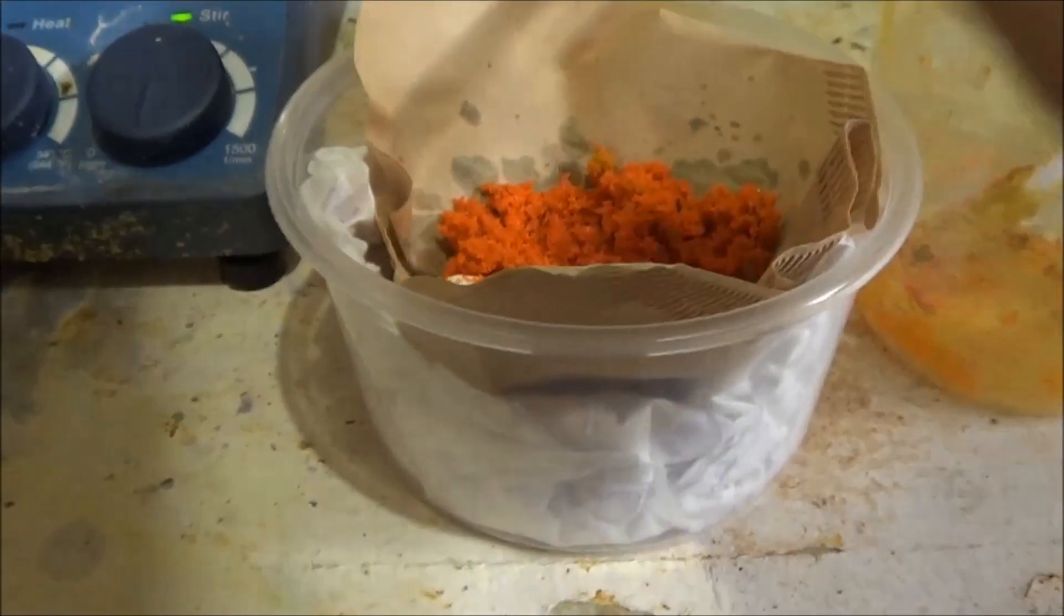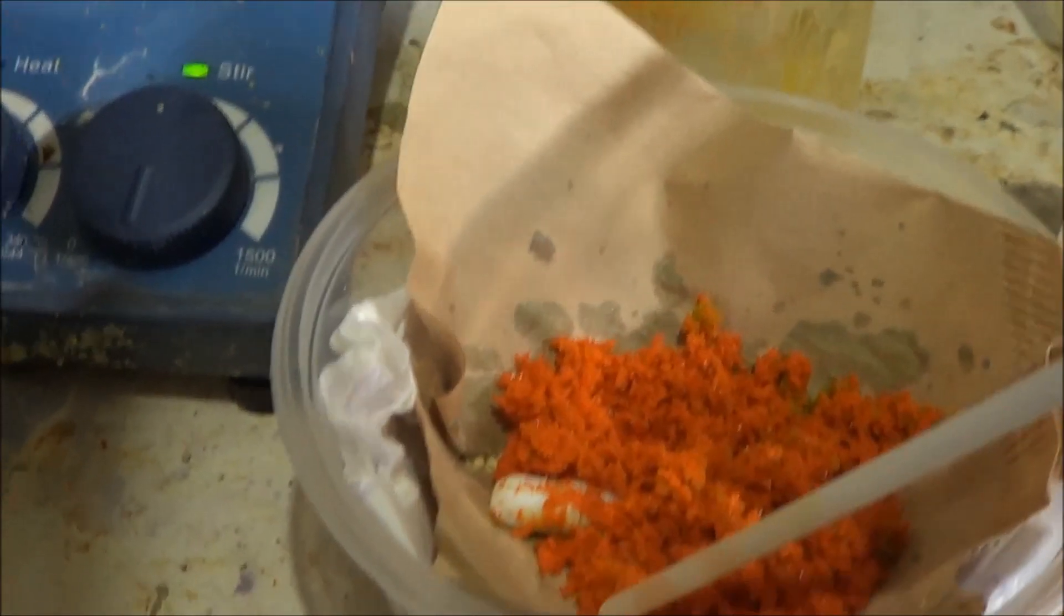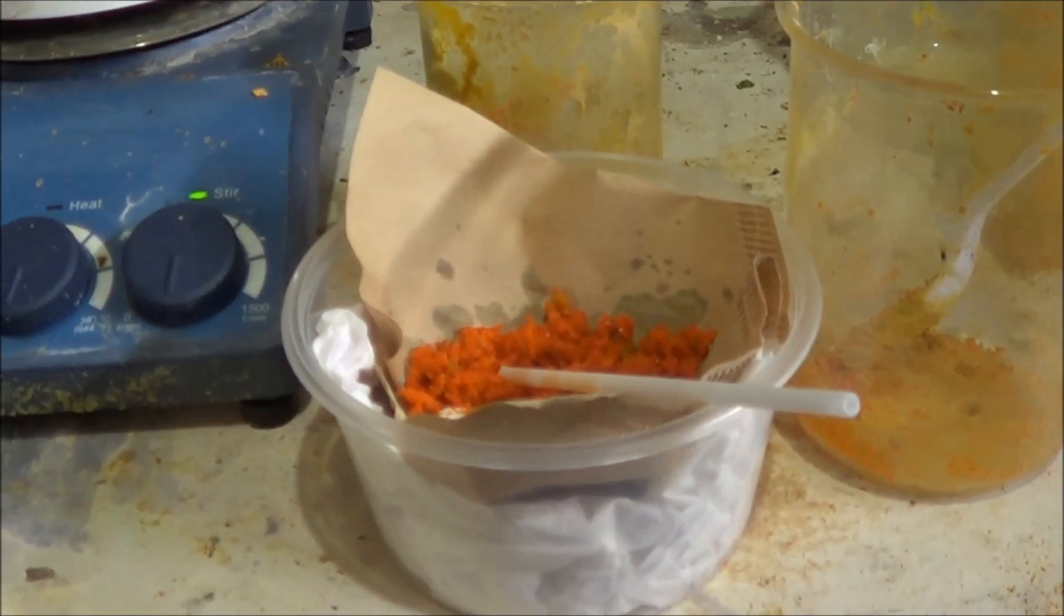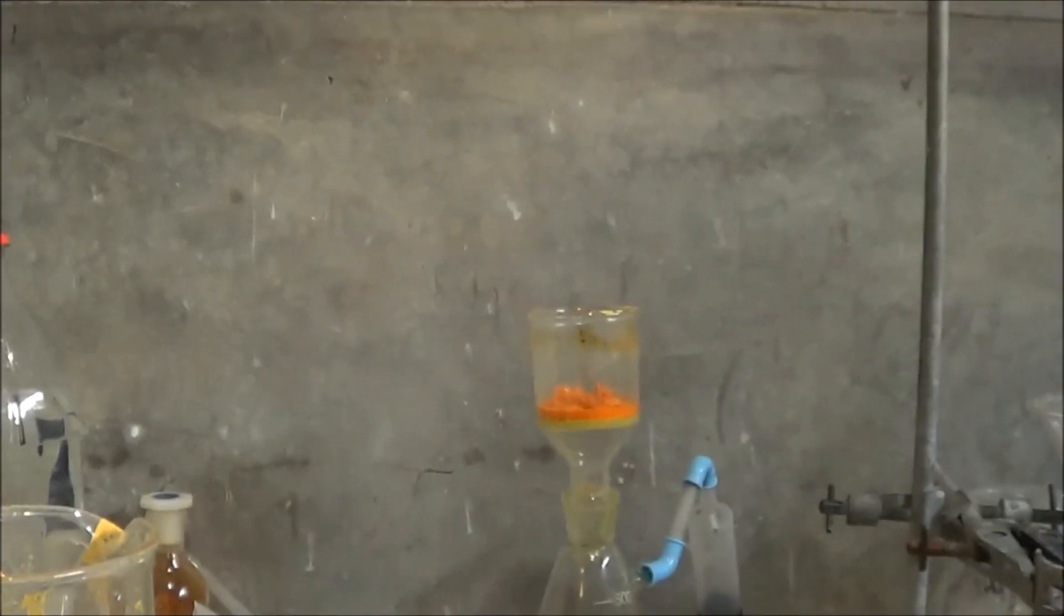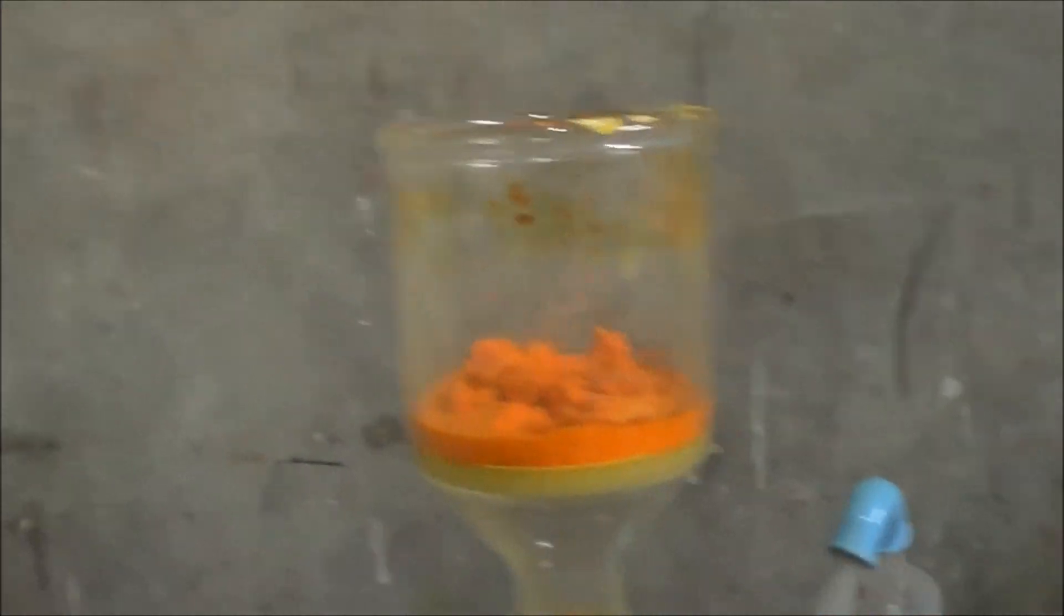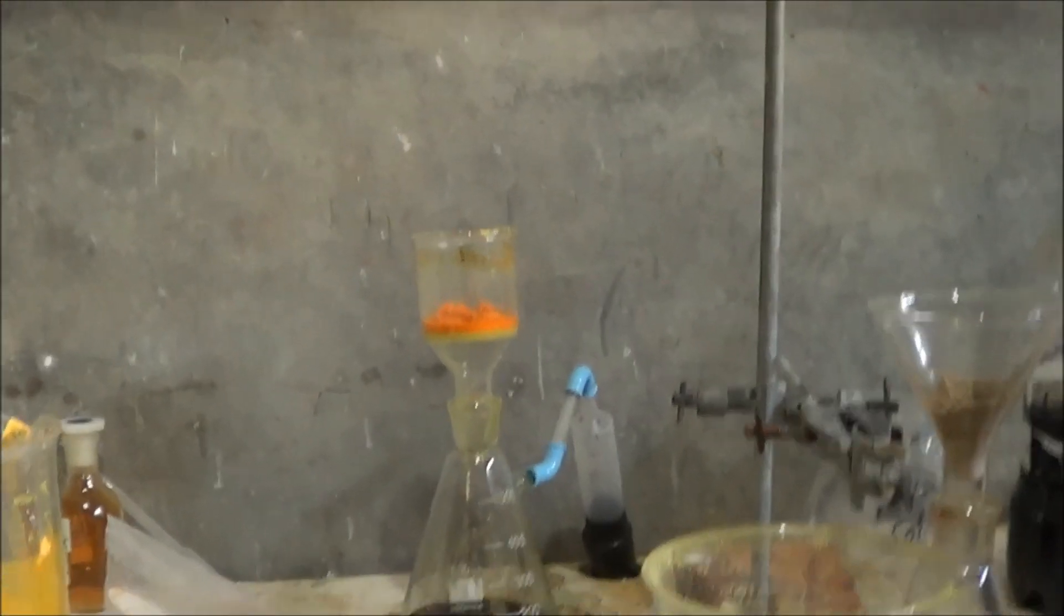And here we have ammonium dichromate crystals, they're quite lovely, actually. So we'll put this outside to dry, which given the fact it's about 45 degrees today, shouldn't be that long. I've also made a little bit more over here from chromium trioxide and ammonia. That was quite fun, actually. I made more just because I want more for the demo that we're gonna do on the other channel, hopefully.